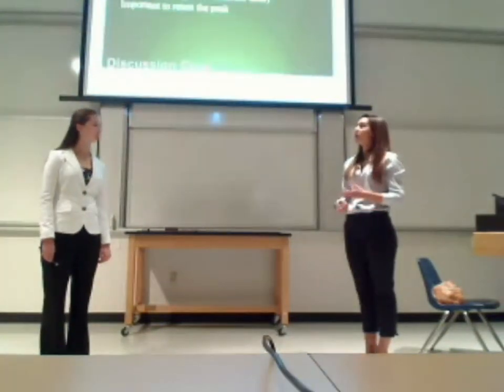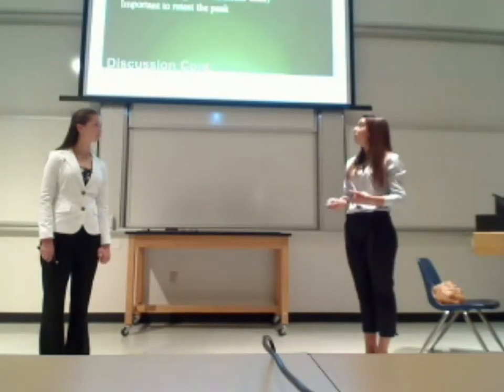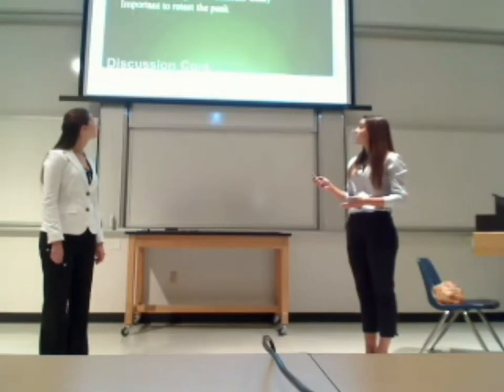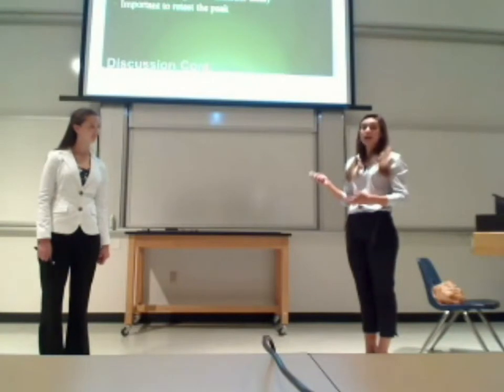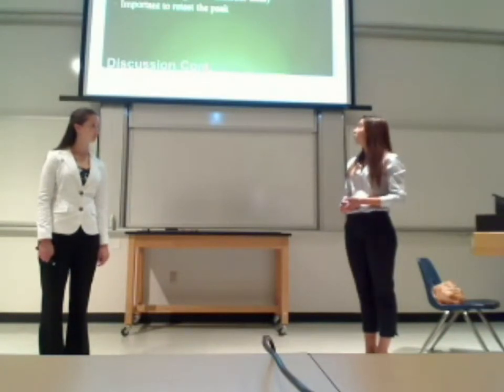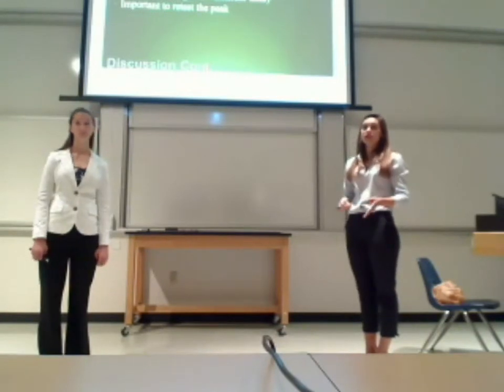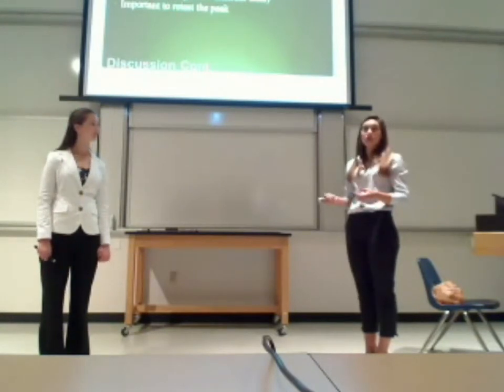All right, so as Carly pointed out, the venom itself, in the crude form, did have anti-cancer effects because it had anti-cancer agents. The fractionated venom could have a potential effect. That's why further research needs to be done, and those do need to be further tested. After those peaks are tested, the single enzymes should be fractionated out using ion exchange chromatography potentially to see if those peaks could have pharmacological uses and should be further developed into medication, as described before, as antidotes.